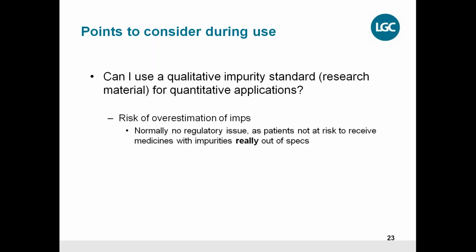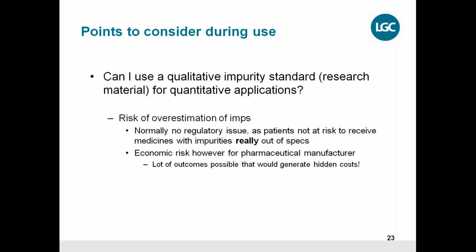They say we have no issue when you are overestimating your impurity, but you should keep in mind that there are really economic risks there. And I have put up a few economic risks down here that you should consider. There are a lot of possible outcomes that can generate hidden costs. And as I said, these hidden costs can be much higher than investing in a carefully characterized impurity reference standard in the beginning.